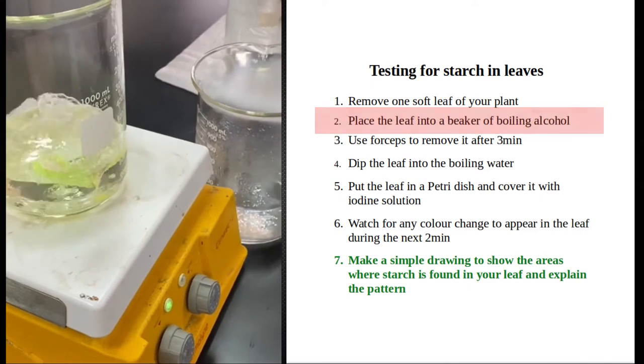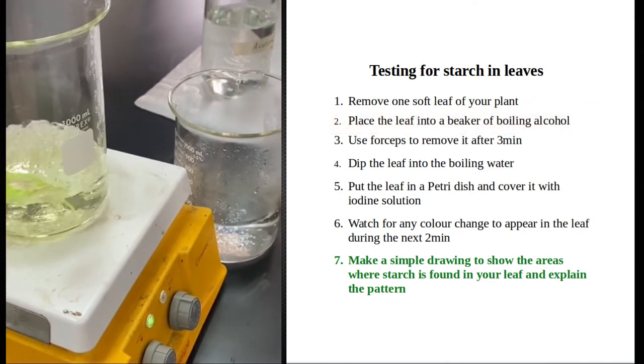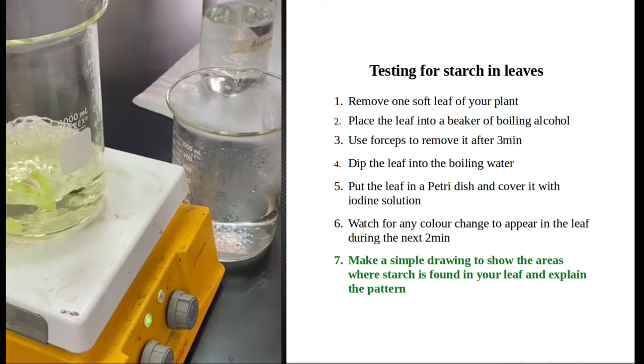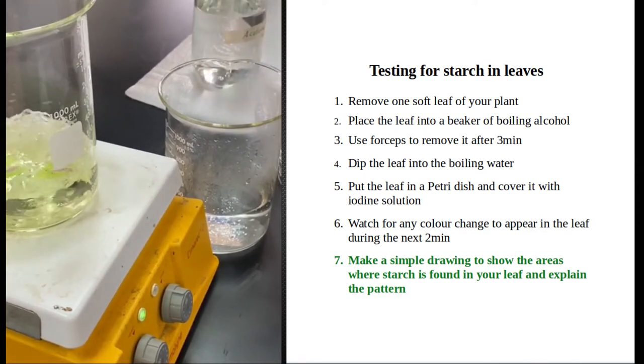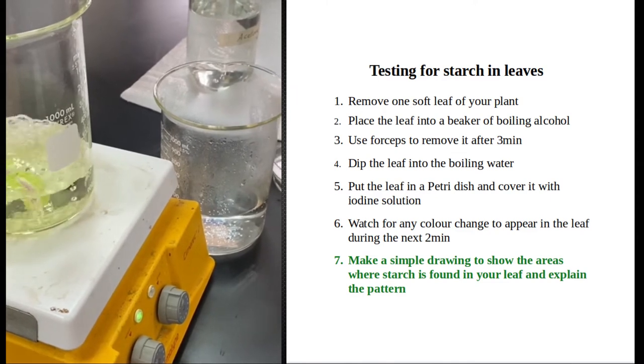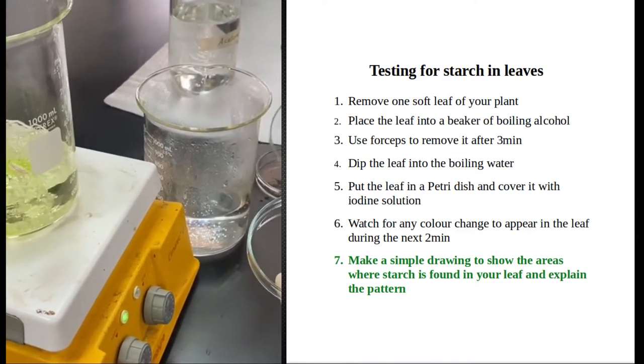The ethanol will dry the leaf and it will become too brittle. I will put it in hot distilled water to give it some flexibility, and then I will put the leaves in glass petri dishes.